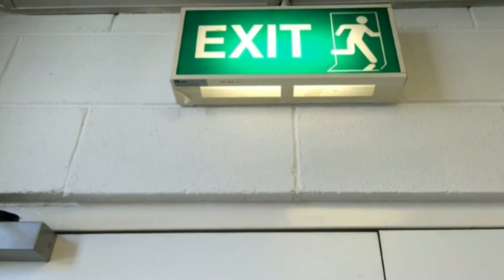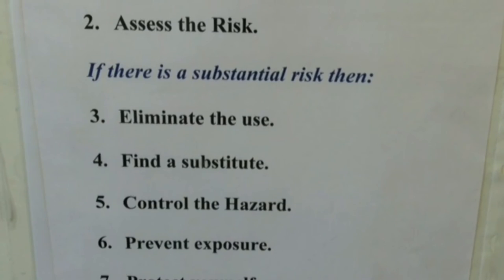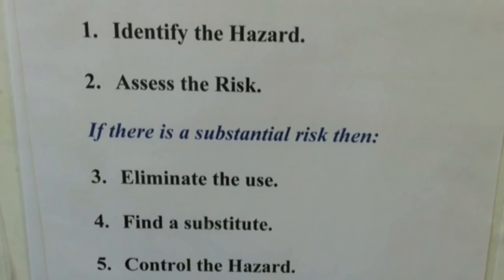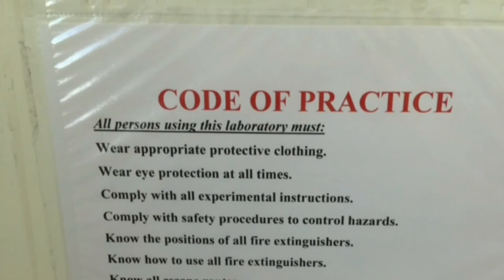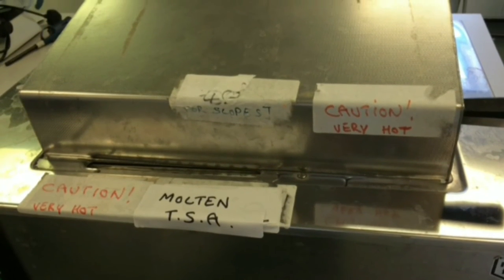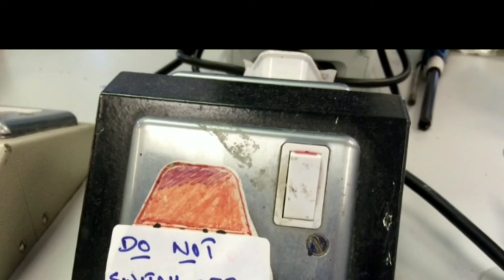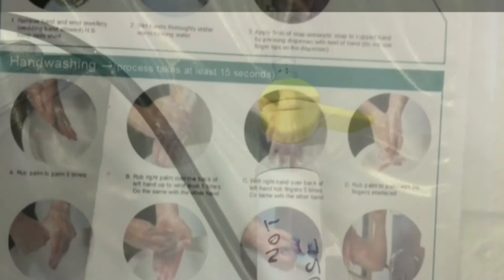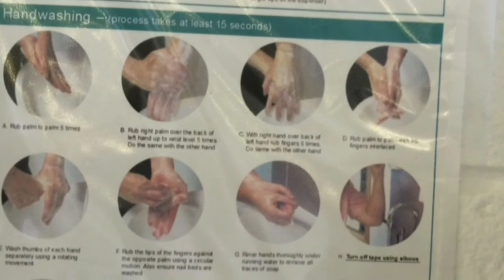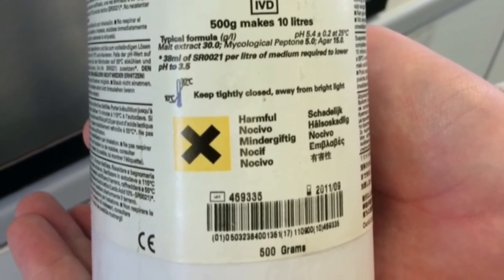Lab safety is important to protect yourself and others. If you do not practice lab safety properly, you will put yourself and others at risk. Please be aware of all the warning signs and hazardous labels.